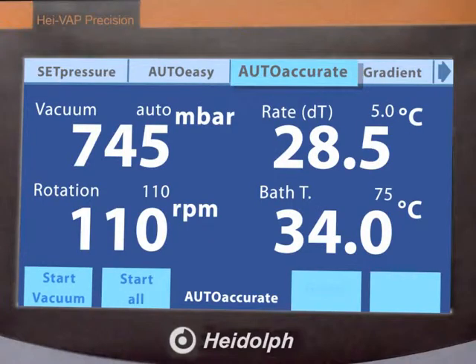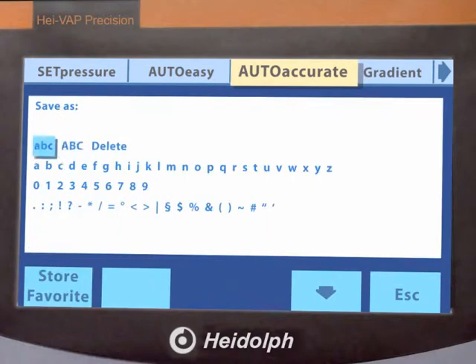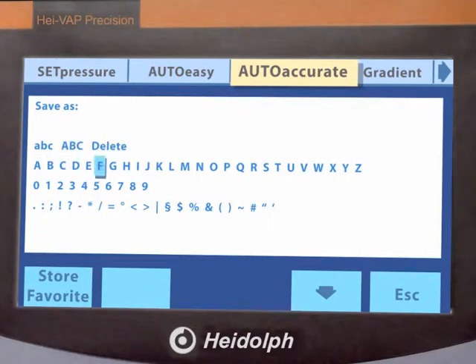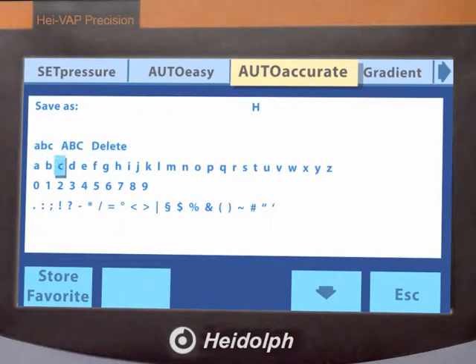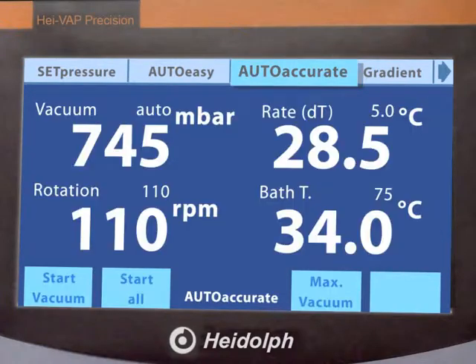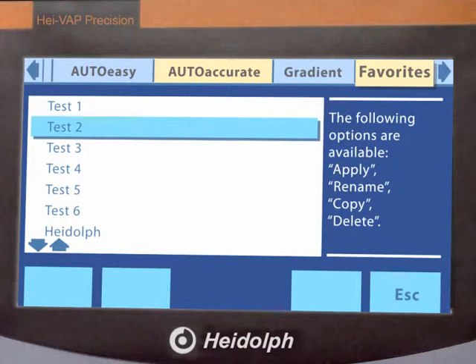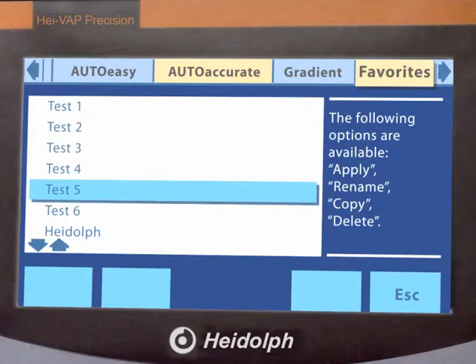Save time with your individualised pre-programmed parameter settings for your 30 most common applications by saving them under an individual name. Each program ramp offers 20 separate steps for demanding applications.